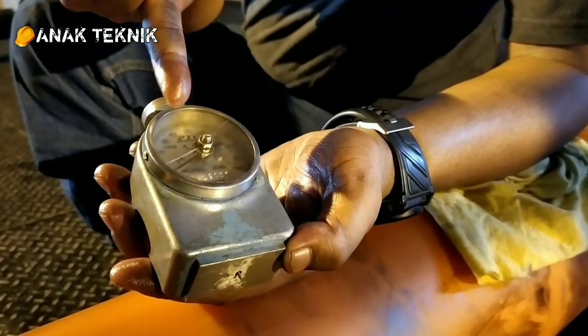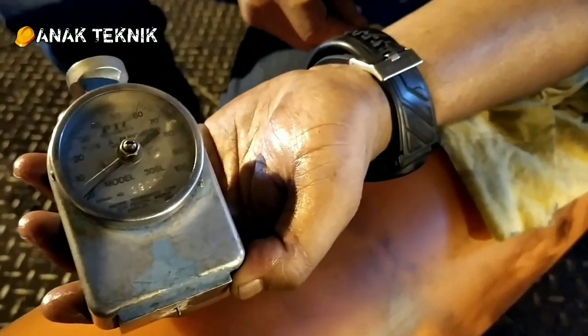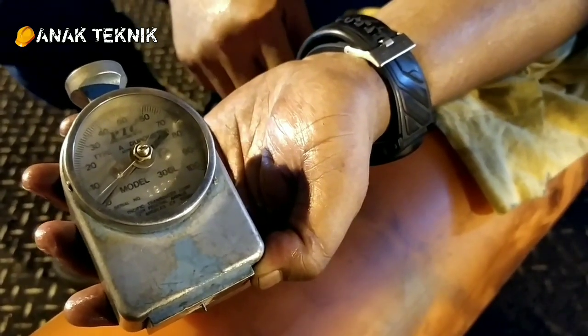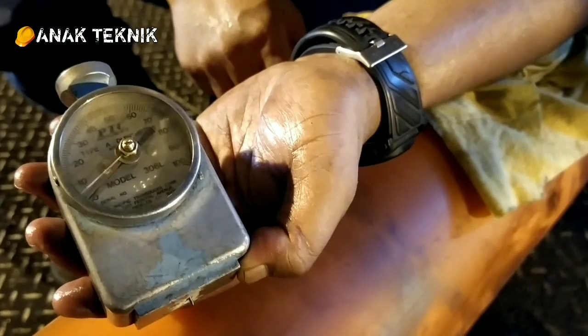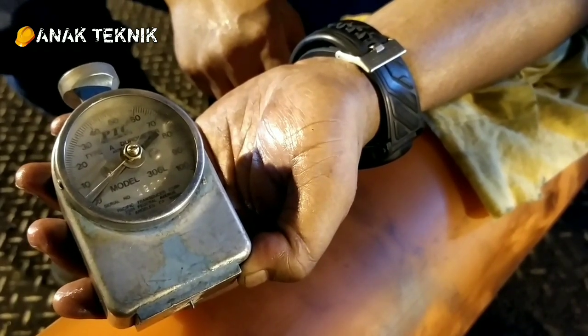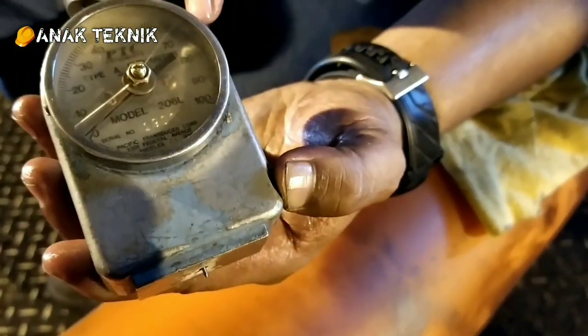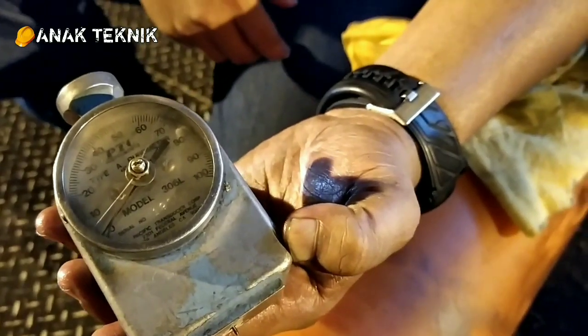Di sini ada skala, ada nilai 0-100. Ketika nanti ditempelkan di material tertentu, dalam kesempatan kali ini adalah poliuretan atau PU, nanti akan menunjukkan skala tertentu, nanti akan kita lihat bareng-bareng. Ada 0-100, berarti ketika jarum ini nanti berhenti di titik berapapun, itu menunjukkan kekerasan dari material tersebut.